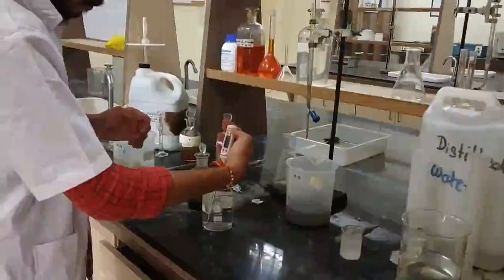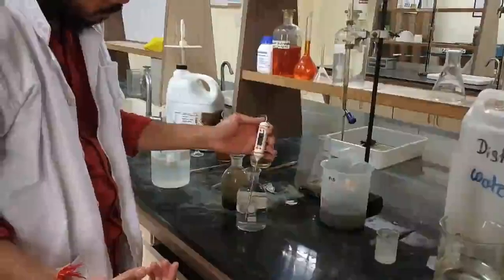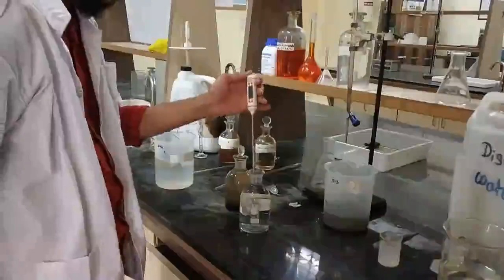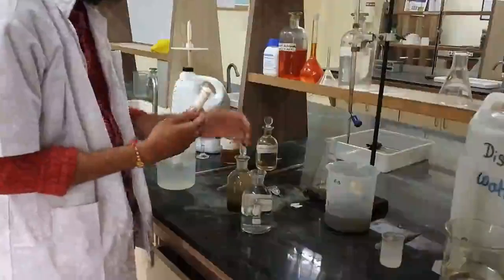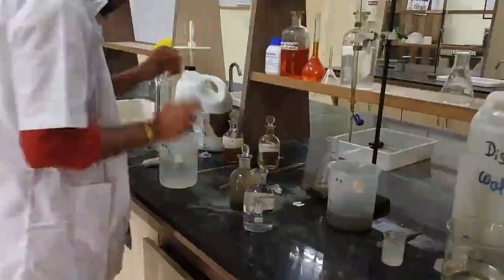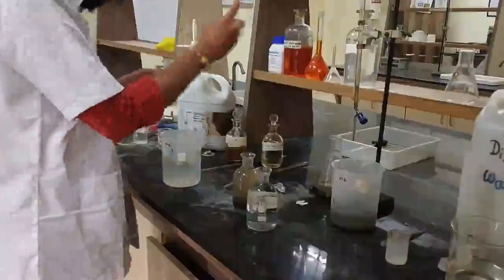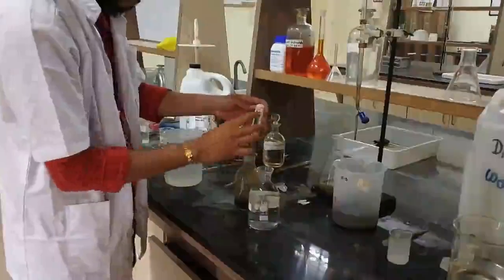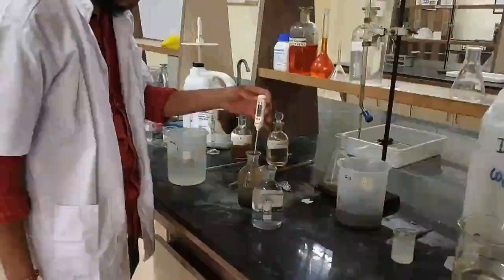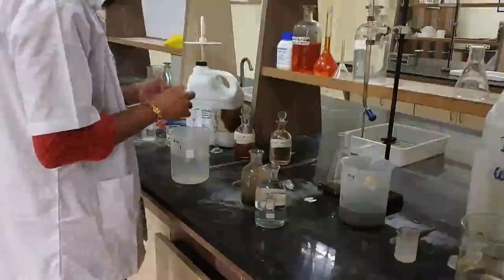Here we get the temperature as 25 degrees Celsius. We're going to measure the temperature of the second sample as well. 25. And approximately we'll be getting the same temperature.